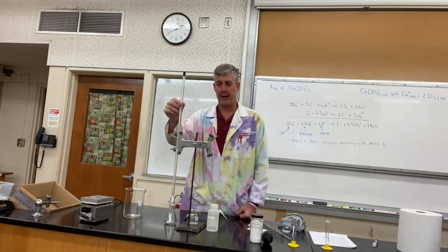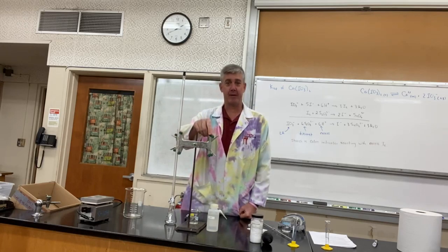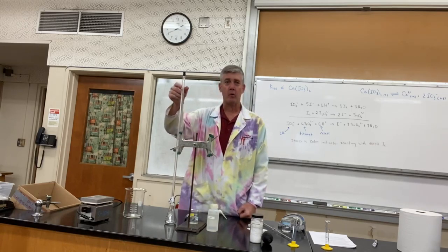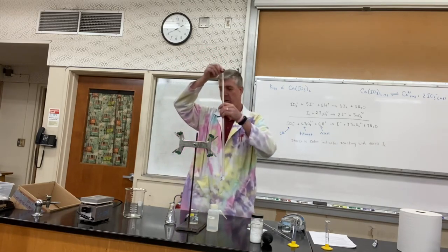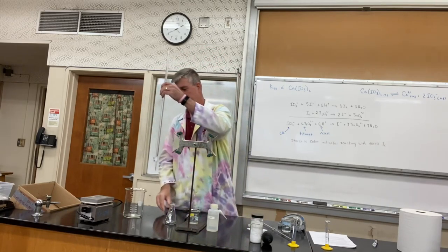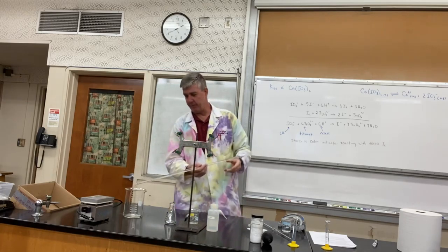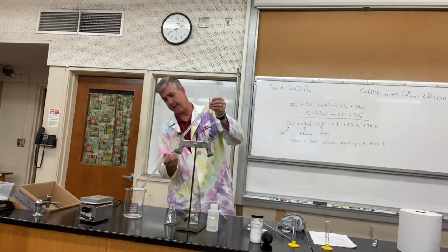So we're going to be using our burettes and we're going to need a burette stand and a burette clamp. The burettes are stored with deionized water, so one of the first things we're going to do is empty our burette. I'm going to just do this all on a waste beaker right now.